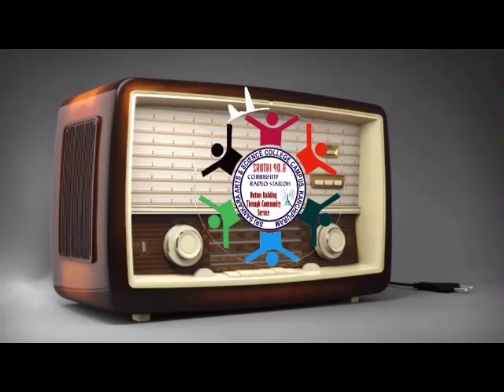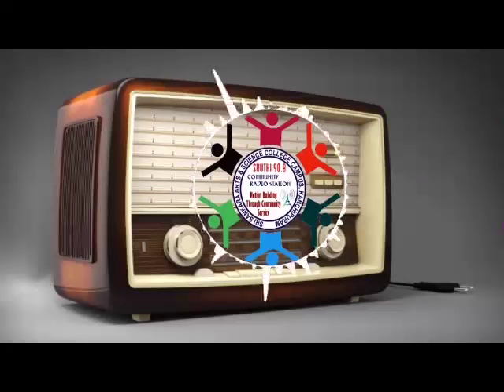The second parameter, based on the mode of operation, the bioreactors can be classified into 3 types. Number 1, batch reactor. Number 2, fed batch reactor. Number 3, continuous reactor. The batch reactor is very simple. In this type of reactor, we supply the nutrient at one time and harvest the product at one time. This is the batch fermentation. But in case of fed batch reactor, we are supplying the nutrient at one or more times but harvesting the product at one time. This is the difference between batch reactor and fed batch reactor.